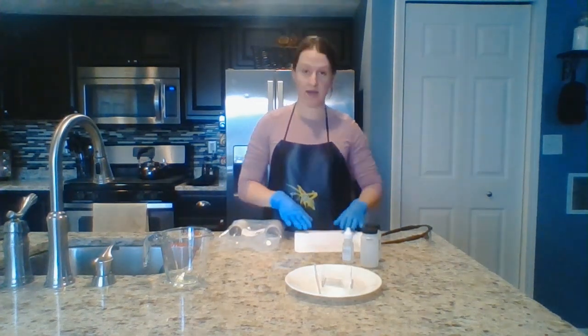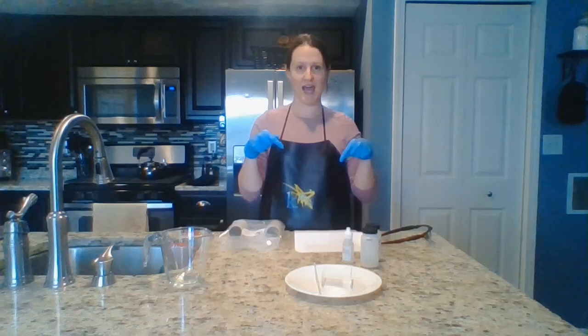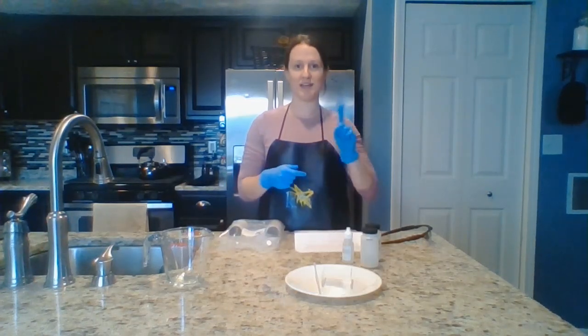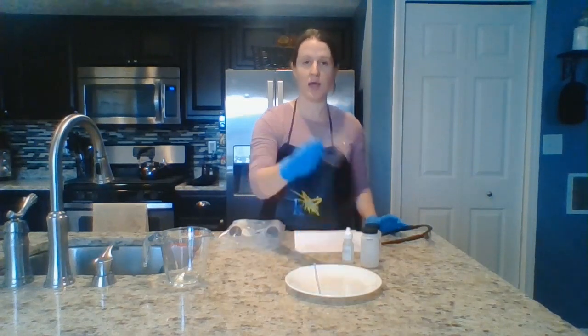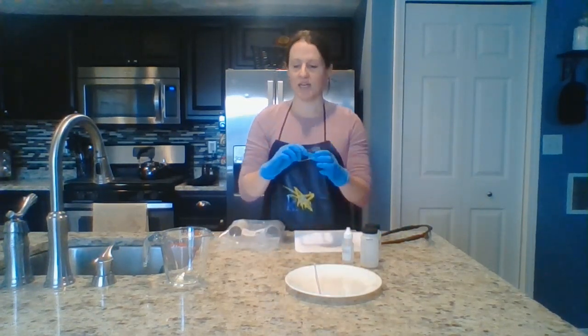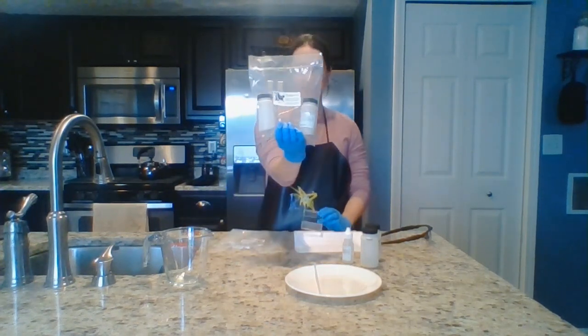So this lab requires kind of a lot of advanced prep. So we'll be doing the advanced prep right now, and then we'll come back for parts 1 and 2 a little bit later. The advanced prep requires you to make an agar cube. And to do this, you will need your agar cube kit, which looks like this.